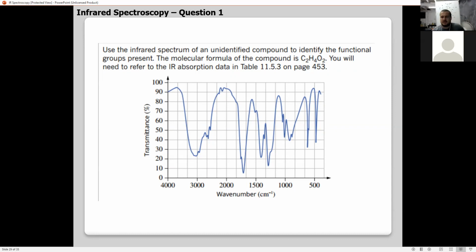Okay, any ideas? What can we see? So here we've got our oxygen and hydrogen stretch. Here we've got carbon to oxygen double bond. Almost touches the bottom. It's just about bang on in the middle. And this looks messy as heck, right? We've also got carbon to oxygen single bond here. So that is a carboxylic acid.